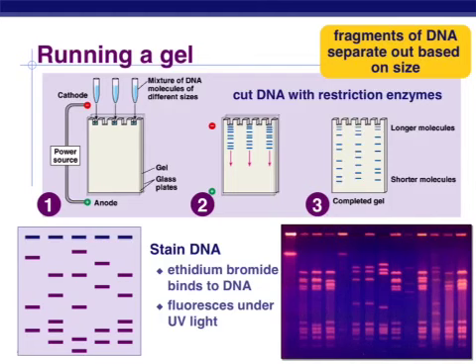But DNA is clear, so you have to stain it. And the stain that we use is ethidium bromide, and ethidium bromide binds to DNA, and then it fluoresces under UV light. So we stain it, we let the stain sit and take, and then we put it on a UV light or box light source, and you turn the light on, and then you'll see these stains glow. They'll fluoresce.